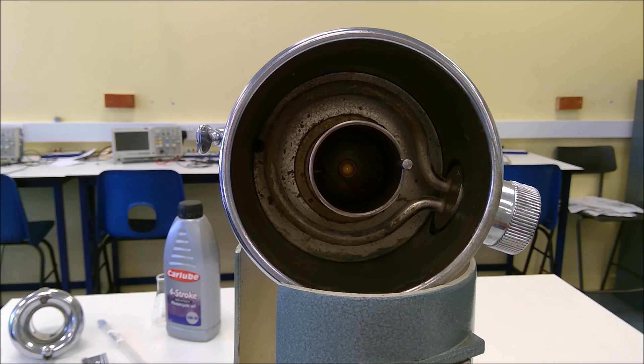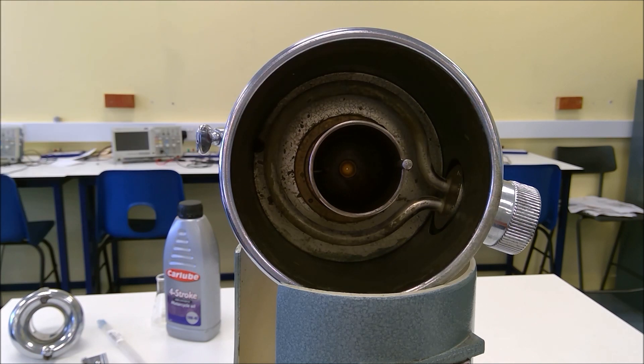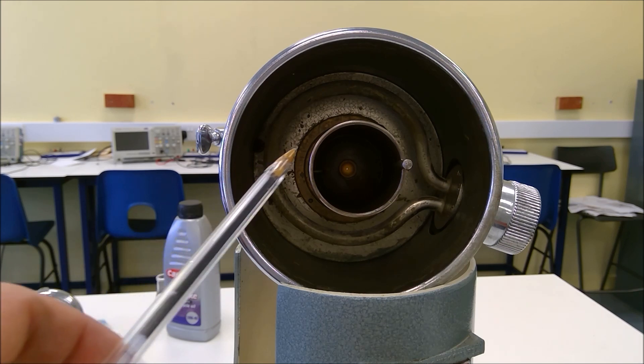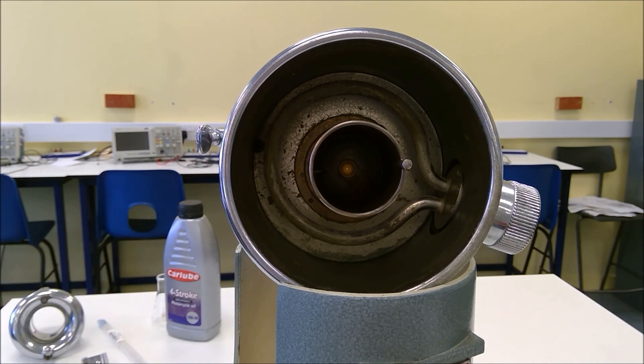Looking more closely at the main components of the Redwood viscometer, we can see we have the water bath around the outside. In the center we have the vessel where we're going to place the oil, and if you look very closely at the center of the vessel you'll see the small orifice where the oil is going to drain through. There are actually two different types of Redwood viscometer — the one we're using here is Redwood One, but there's also Redwood Two where the orifice is somewhat larger, and that's for measuring higher viscosity fluids.